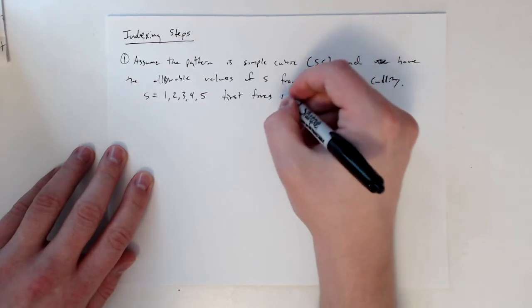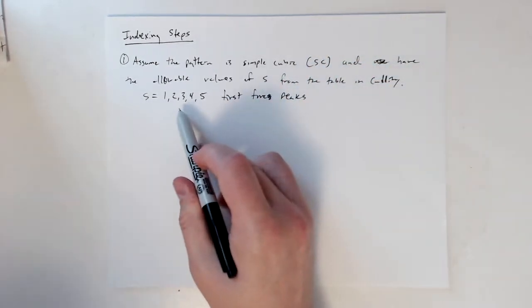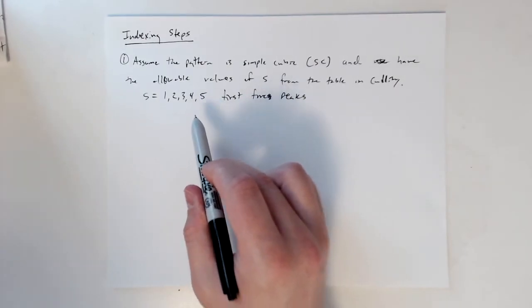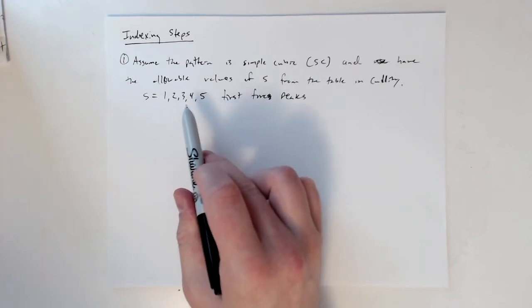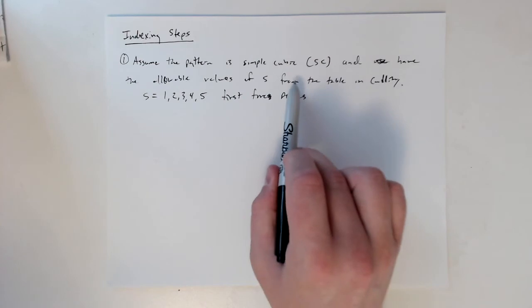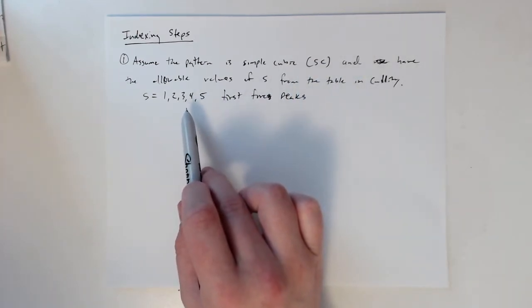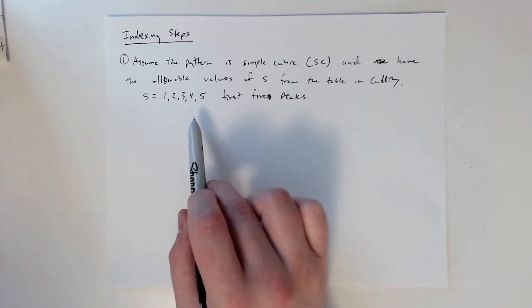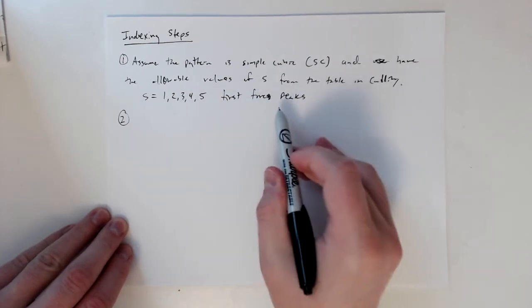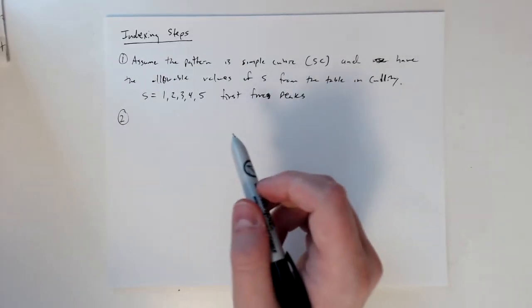And remember that these S values are h squared plus k squared plus l squared. So it basically tells us the values of h, k, and l by knowing S. So we assume a structure. This tells us what HKL values we're testing for. So that's step 1. Step 2, and I'll show you this table in a bit when we get into the example.